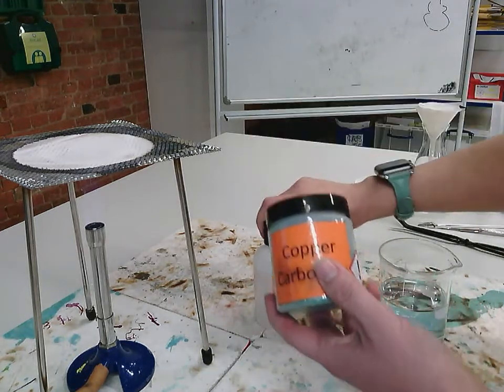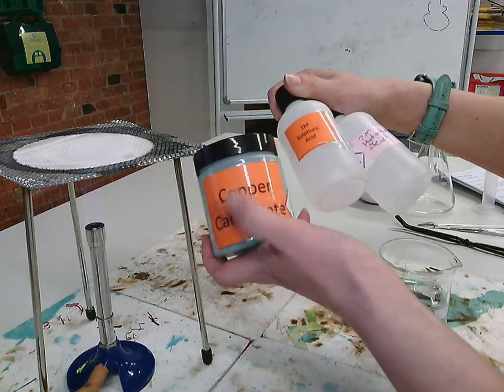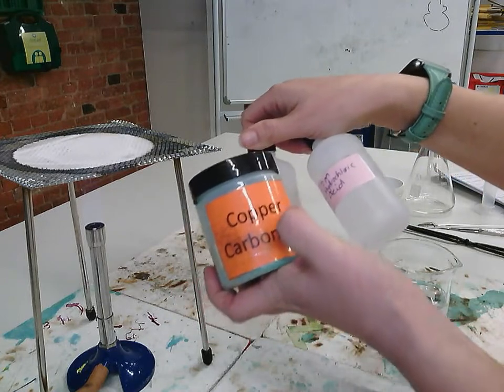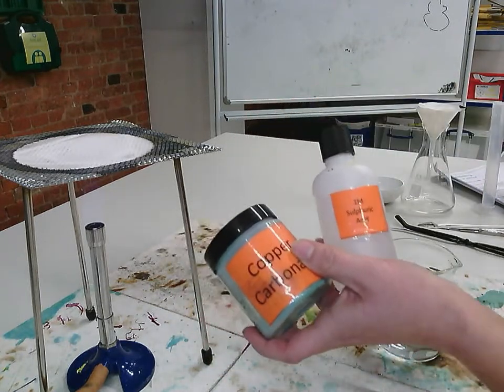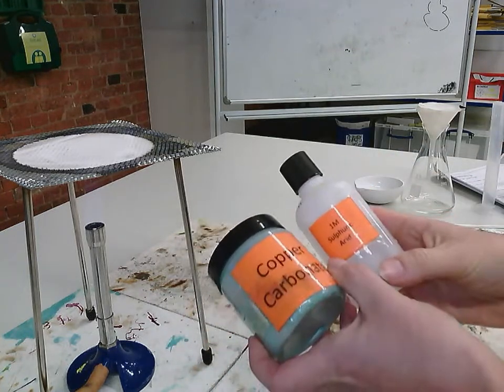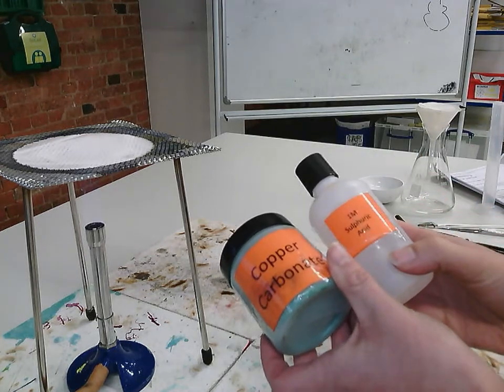And out of the two acids, so I've got copper, and I could react it with sulfuric acid to form sulfate, or hydrochloric acid to form chloride. So what we need is sulfuric acid because we want to make copper sulfate. So it's important to choose the correct one. So look at the name of the salt and choose the correct one.